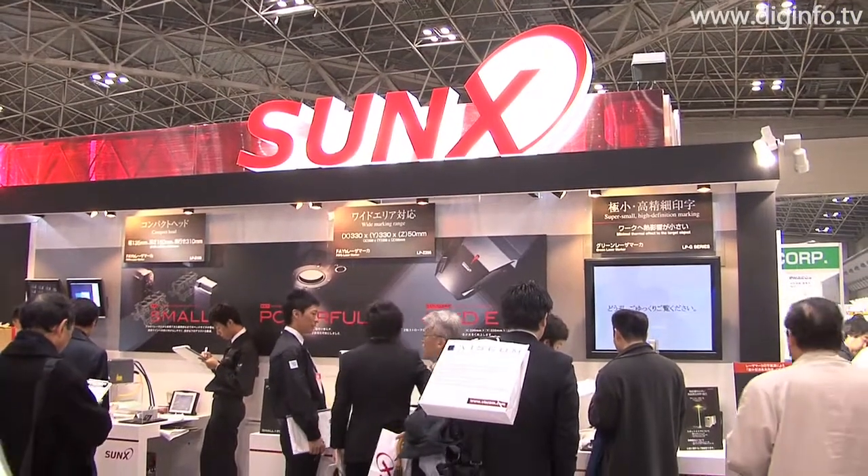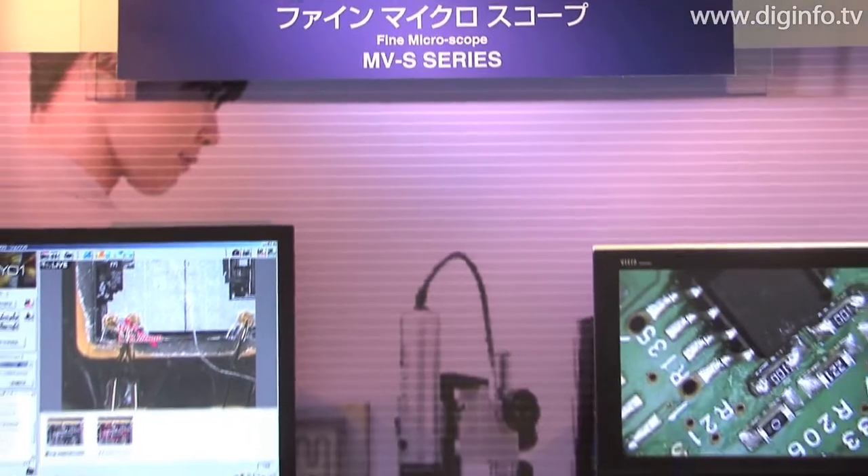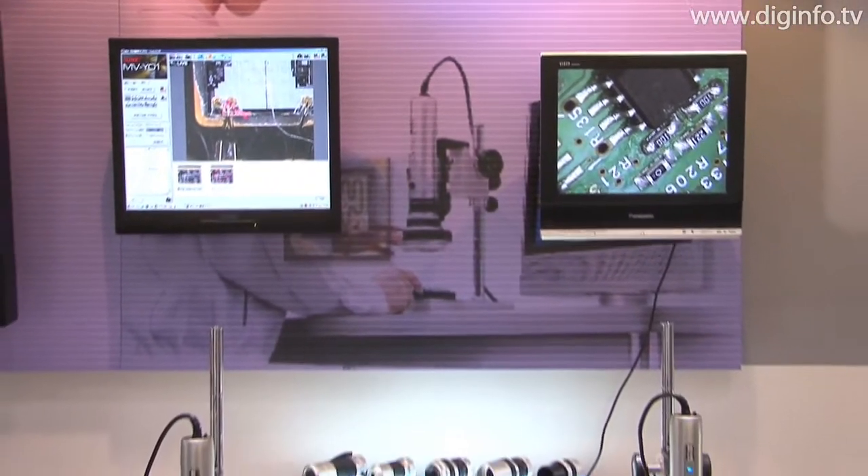SUNX exhibited its MV-S series of fine microscopes at the Laser and Optics 2009 exhibition, which was held at the Tokyo BigSight Exhibition Center.